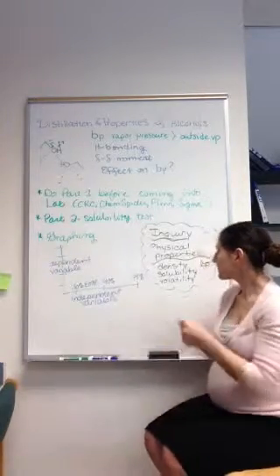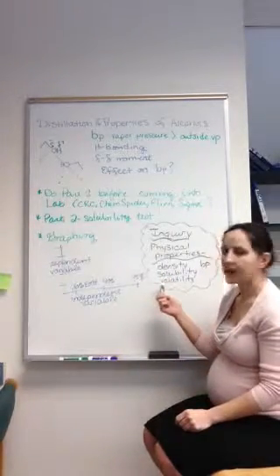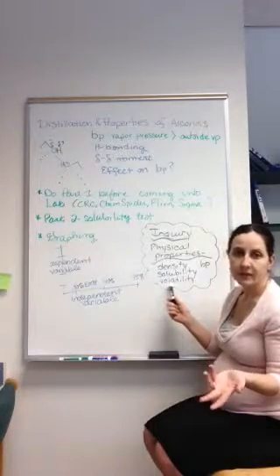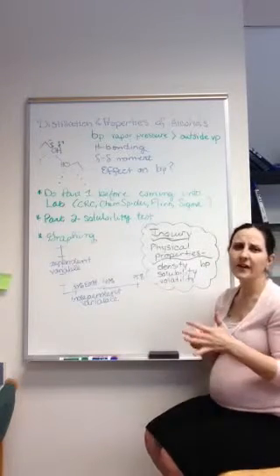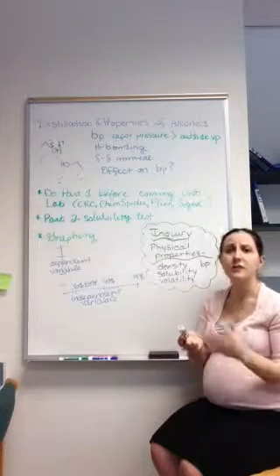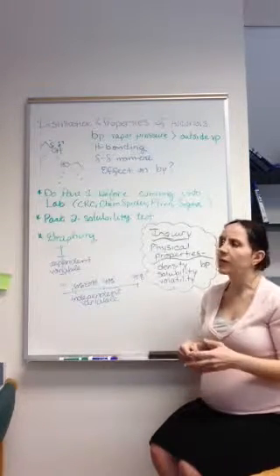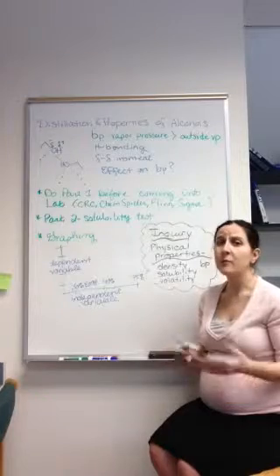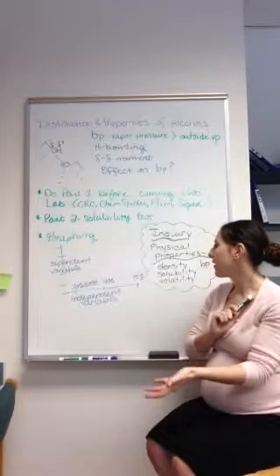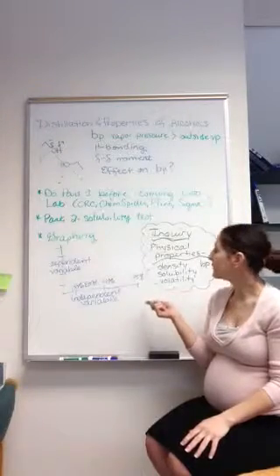Physical properties that we have seen in this lab, the alcohol lab, are density, solubility, volatility, so how well does something evaporate, and then boiling point. One thing that you might want to think about is the glycerol. We didn't really examine it very much. If you look at the end of the lab, after you've done the lab, you'll notice that we did look a little bit at glycerol, but we didn't really explore all of its properties and compare them to alcohol as much as we could have. So you could look at different physical properties with glycerol.